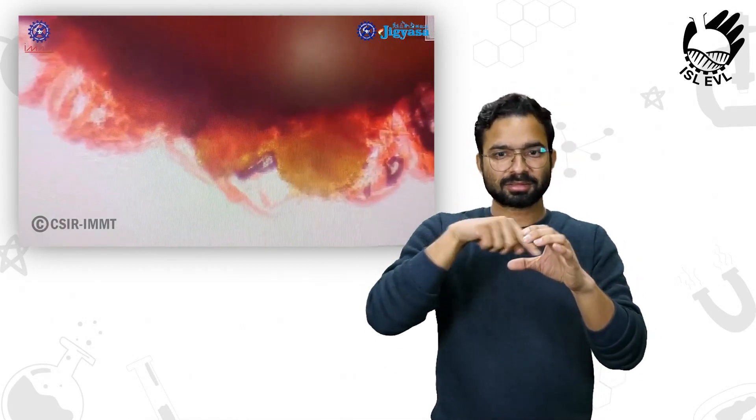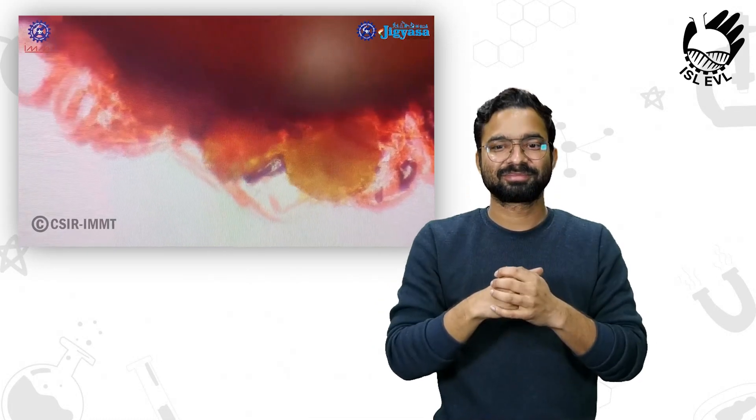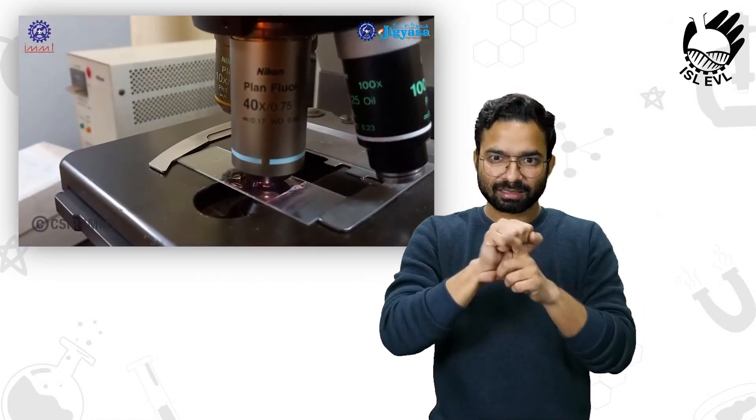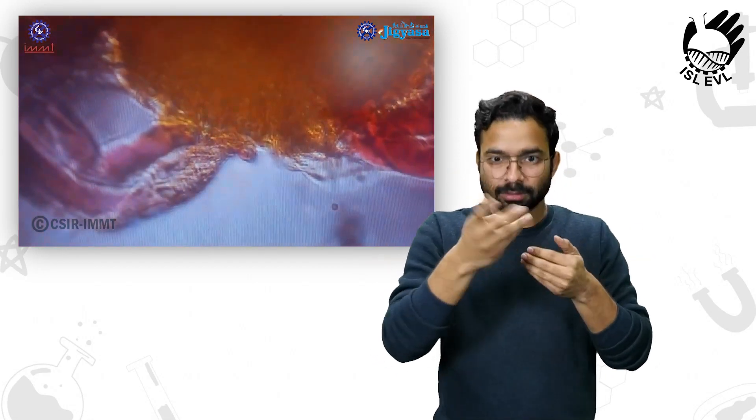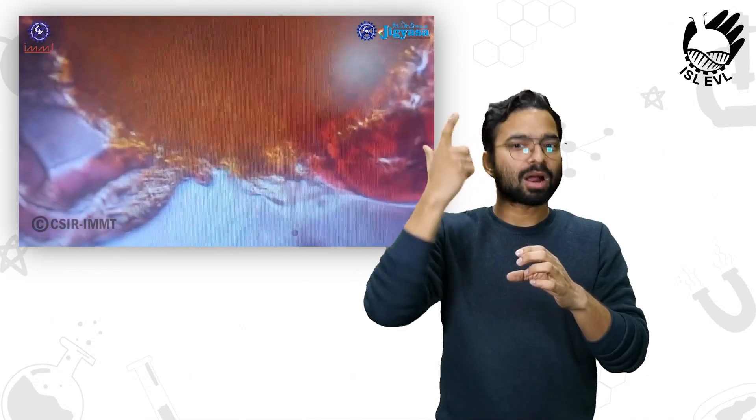Then we can visualize it under the microscope. These yellow colored rounded things are the pollen grains which are trapped by the stigmatic hairs. I have adjusted the lens to 40x magnification. The red colors are the stigmatic hairs and the yellow color is the pollen.